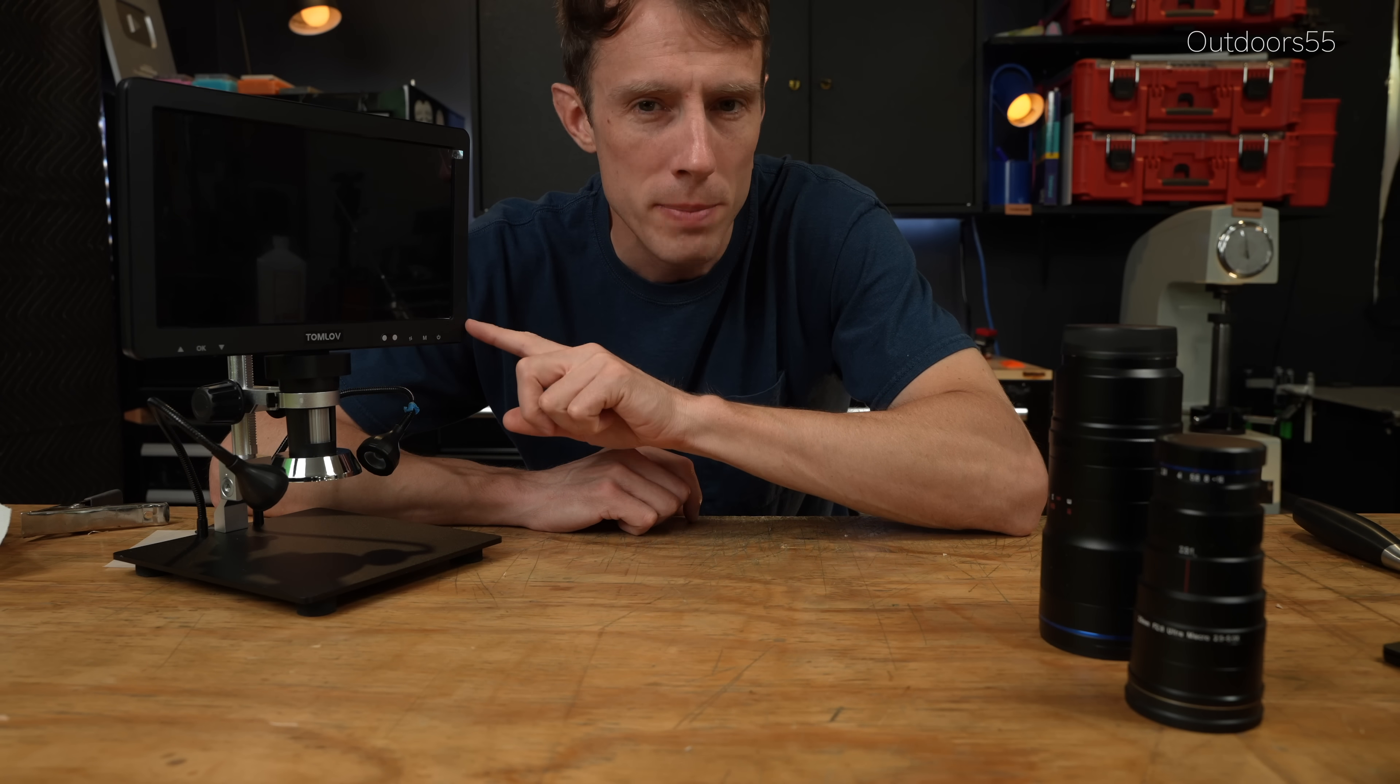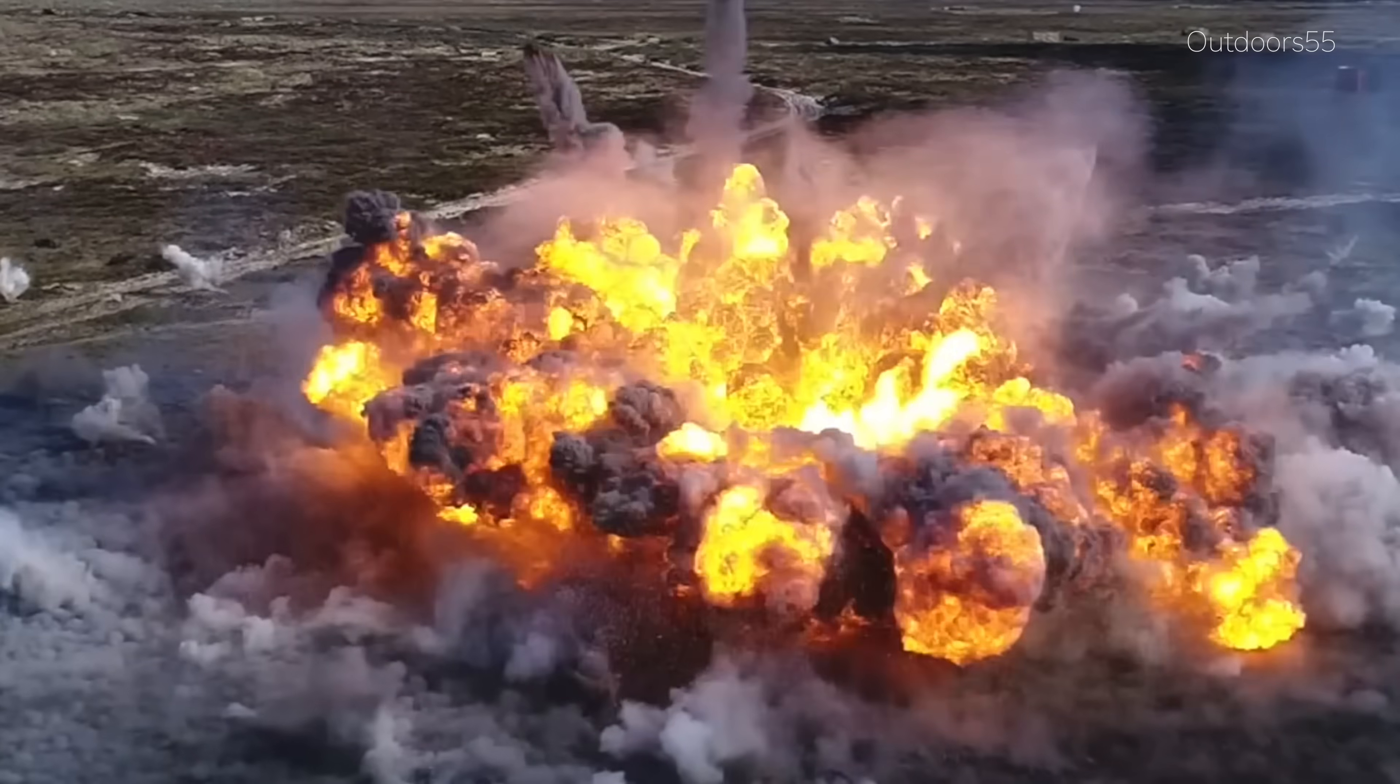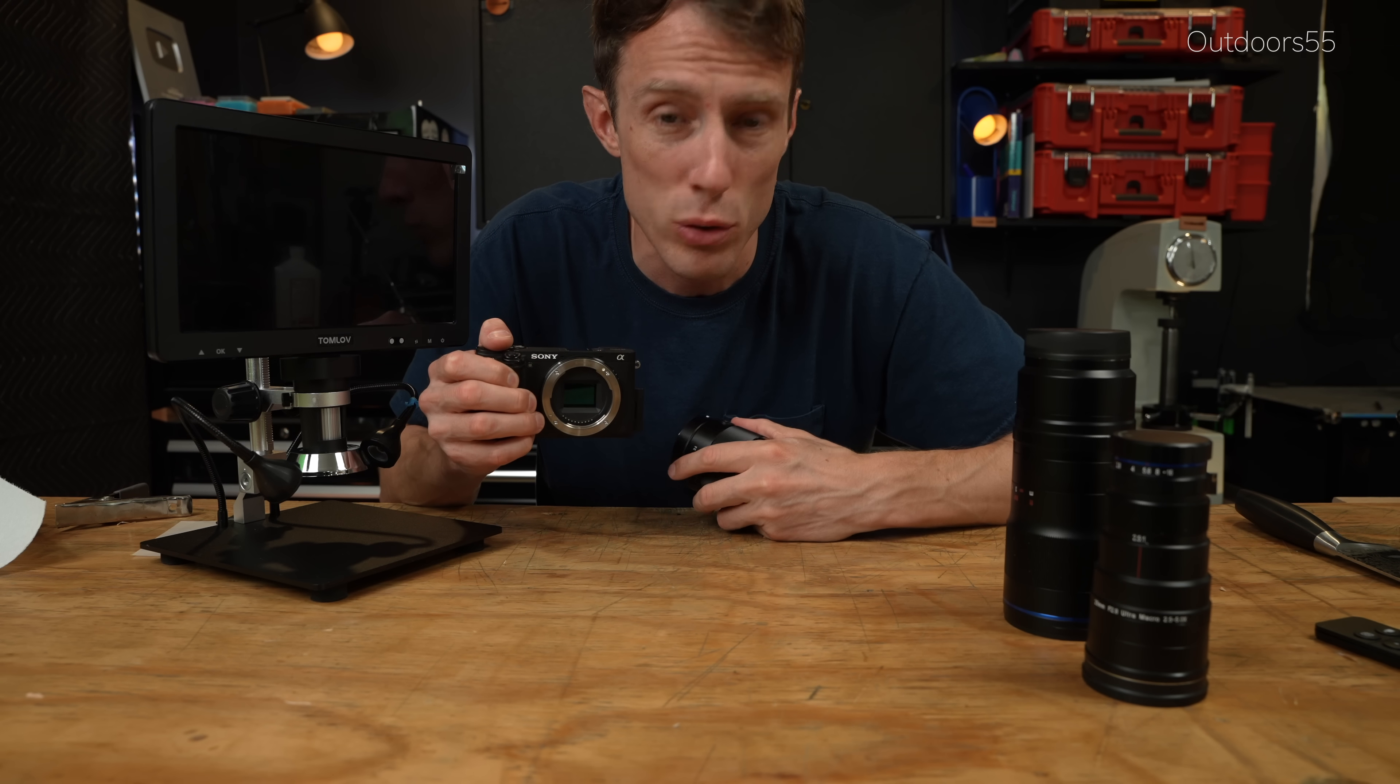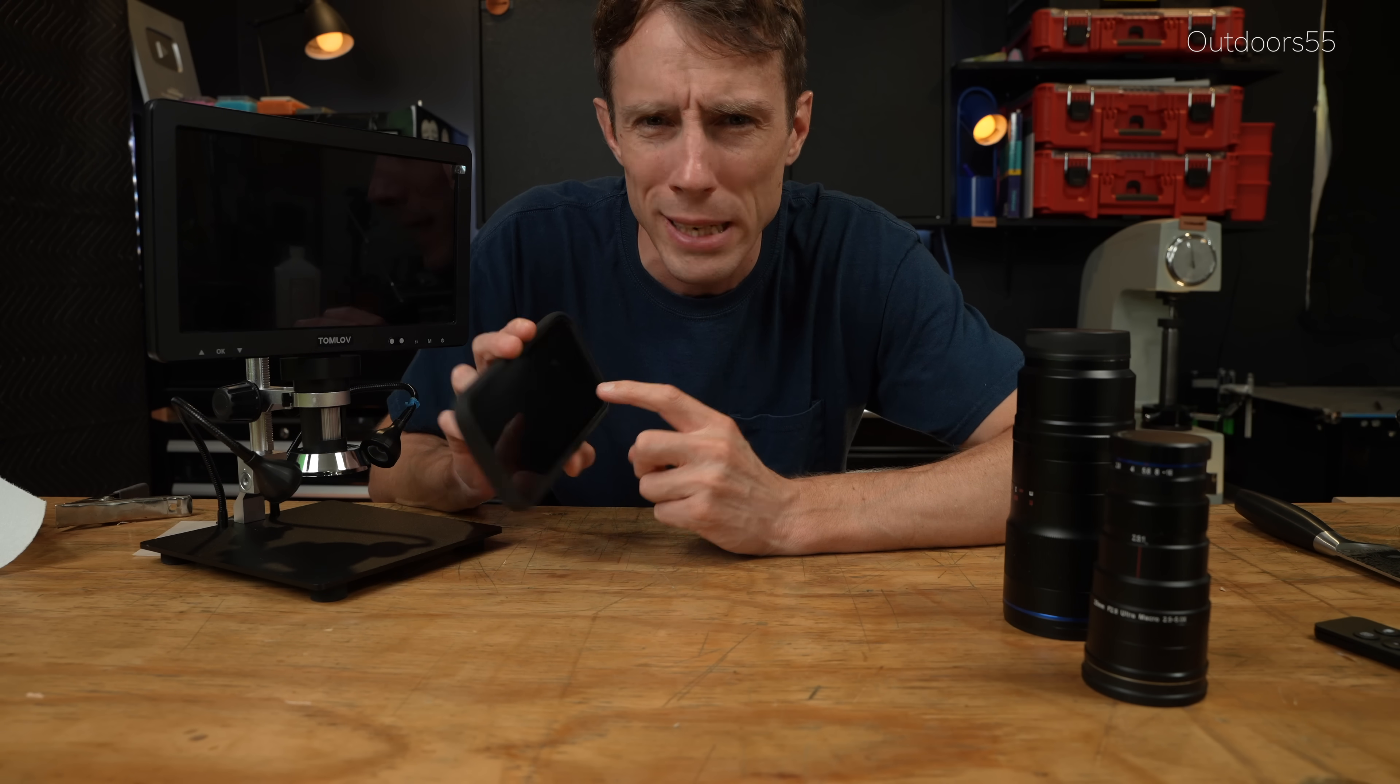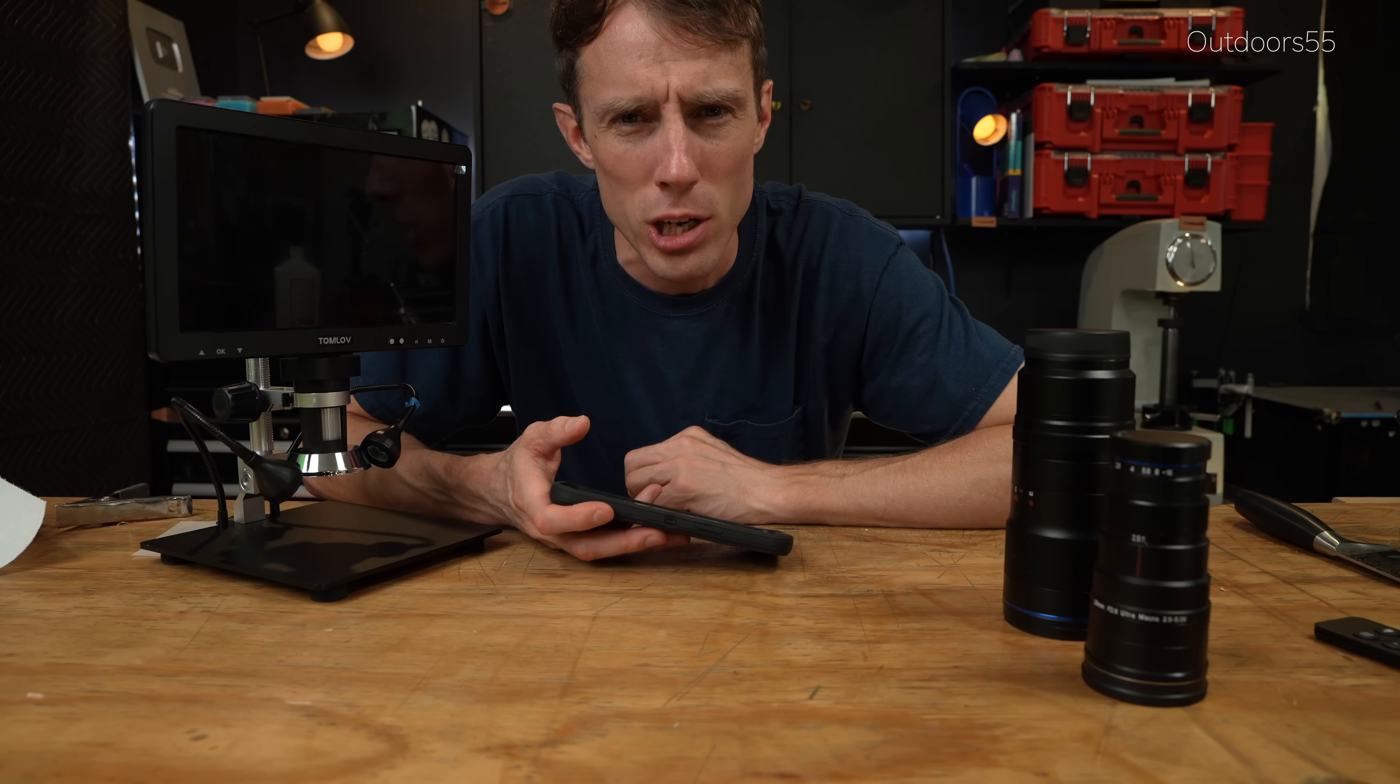Now you may be asking two things. What does that have to do with these cheap digital microscopes? And what happens if you blow the image up? No, I mean zoom into the image on say a computer. Well, it changes the magnification. We're no longer at a 1X reproduction. Now something else you can run into is what happens when you change the sensor size and you use a camera with a smaller sensor. Well, that also changes the magnification ratio. Or what happens if you're viewing the image on a small screen versus an image on a big screen? Well, that can also change the magnification ratio. Well, it does, but it also doesn't. We're not changing the magnification of the lens itself. We're just changing the actual size that we're viewing the image.